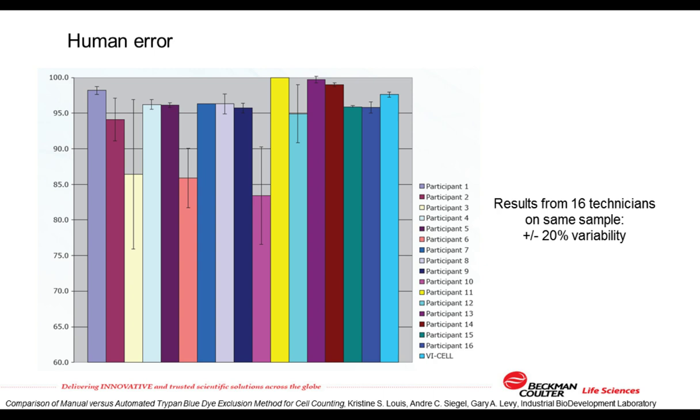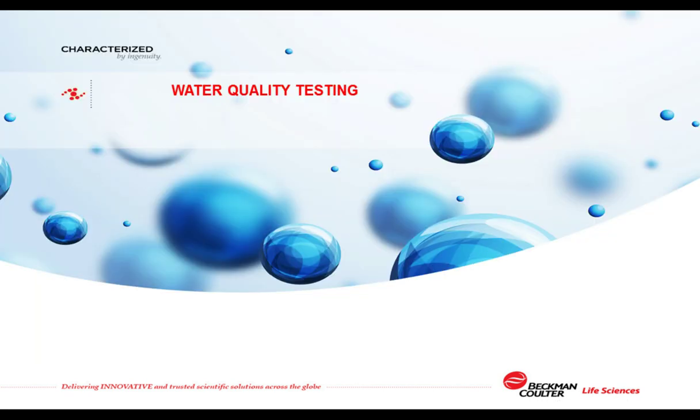Whilst the technical specifications of similar QC instrumentation may appear equivalent, when looking to improve quality control, QC teams should be looking at the level of automation in the instrument to make QC testing more robust and repeatable. For example, a common source of errors in QC testing is sample preparation. An instrument that automates the sample preparation process can bring enhanced reproducibility and robustness to a QC test.